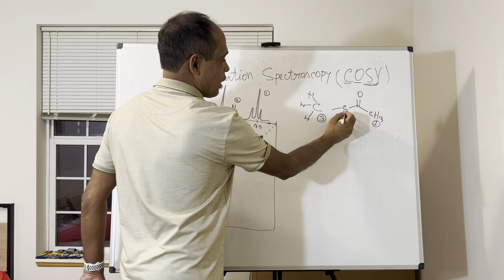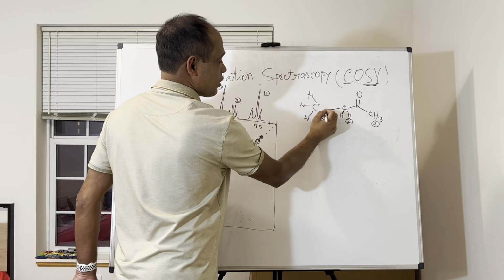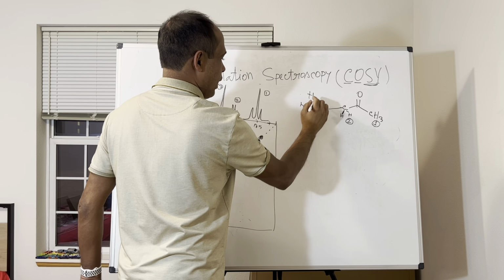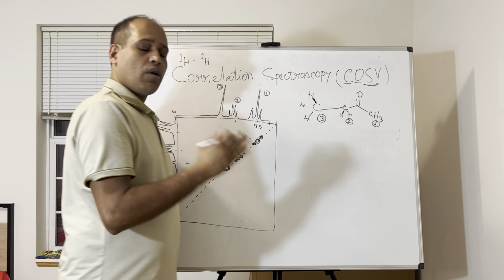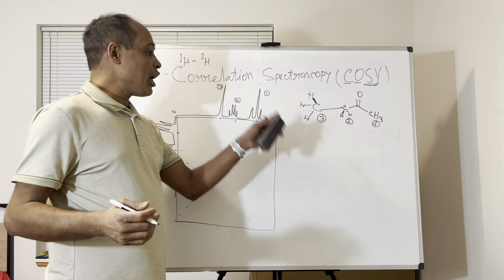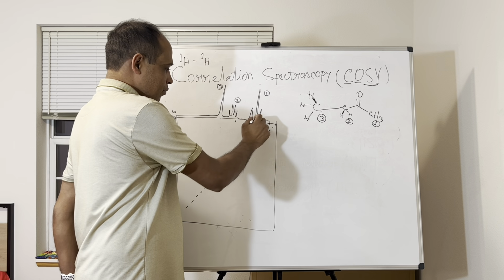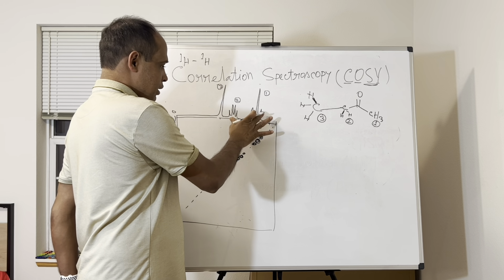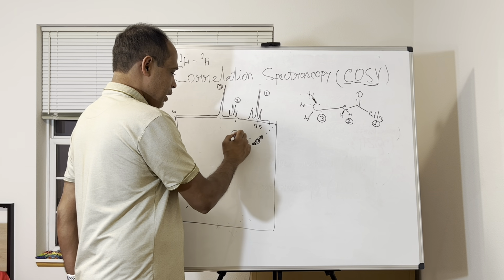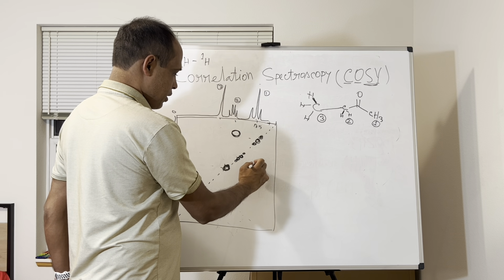So count bonds. If you take bond 1, this is another one, 2 and 3. So COSY always determines protons 3 bonds away, as neighbors. Okay, so neighboring protons have cross peaks. These and these are next to each other, so you will see a cross peak here, and also a cross peak here.